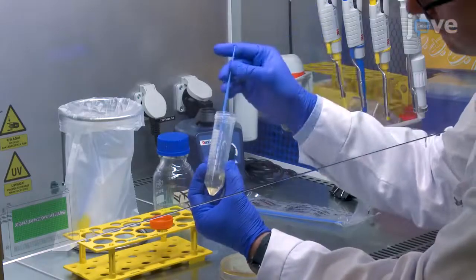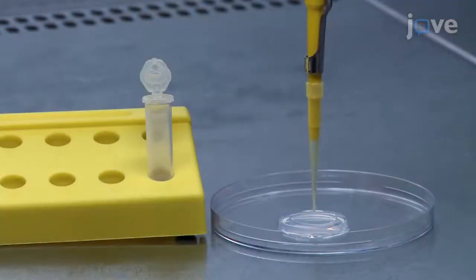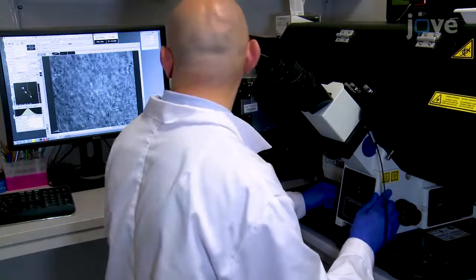Live-cell Bdellovibrio bacteriovorus imaging has been challenging due to the complex life cycle of this predatory bacteria. Our protocol allows monitoring of the stages of the complete life cycle in real time. Although our protocol is based on specific E. coli strains, it may be easily adapted to a variety of bacterial strains, including pathogenic strains.